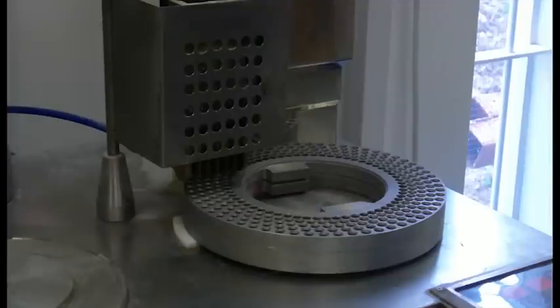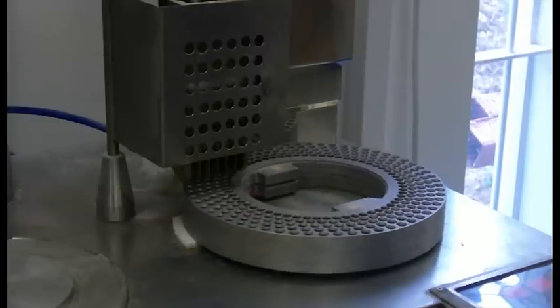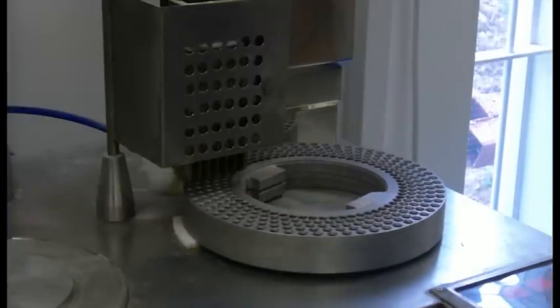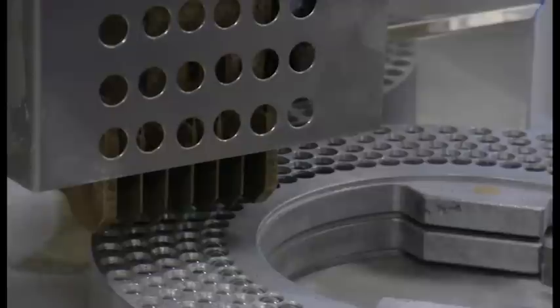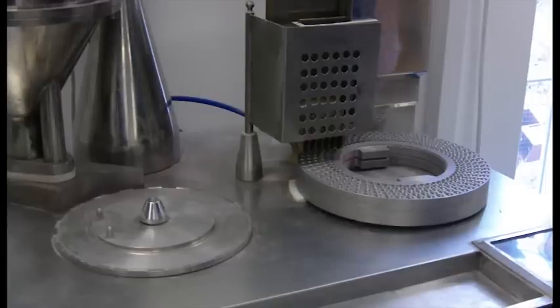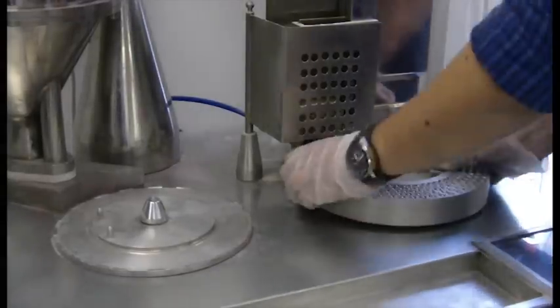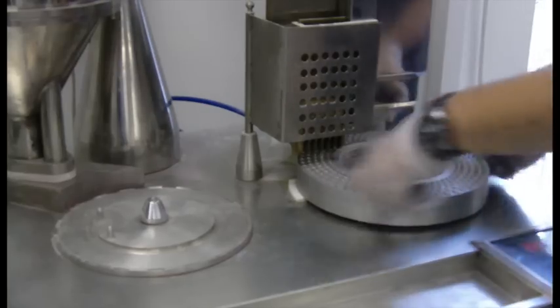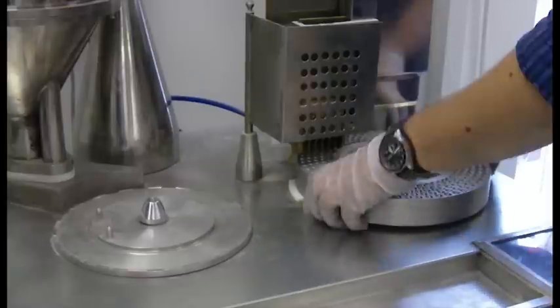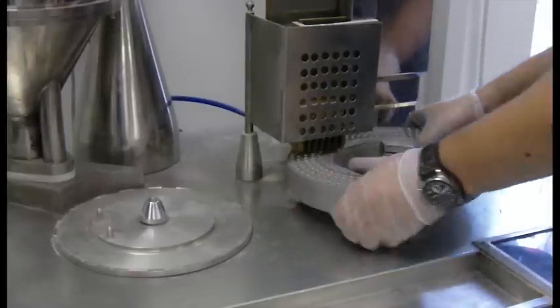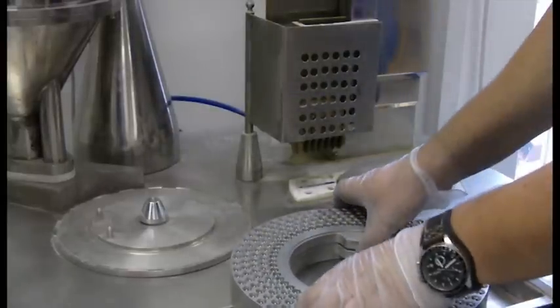The operator then uses the vacuum sucker to individually sort out and fill the capsules into the plate. Plates can be made from 000 to 5 size. The operator then uses the vacuum to separate the capsules. Once the capsules are separated, the plates are pulled apart to release just the bottom section.